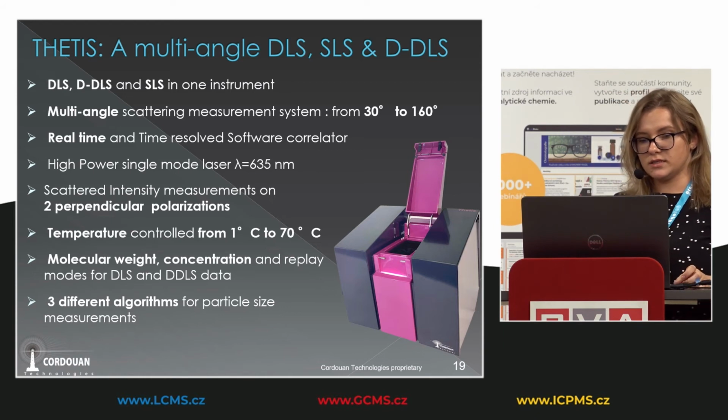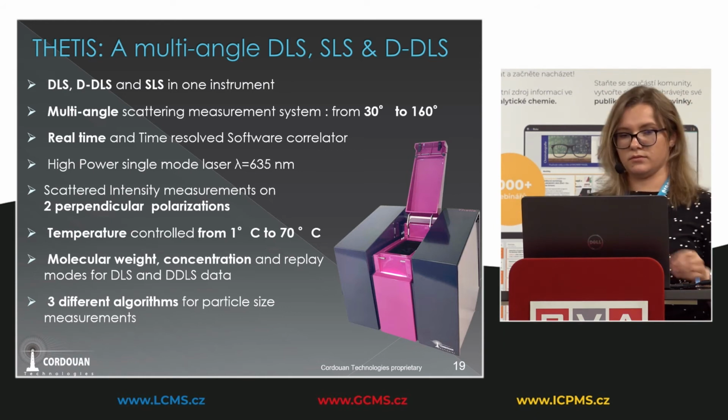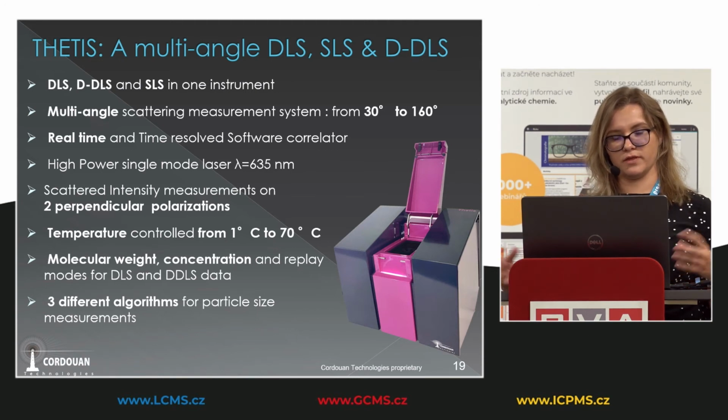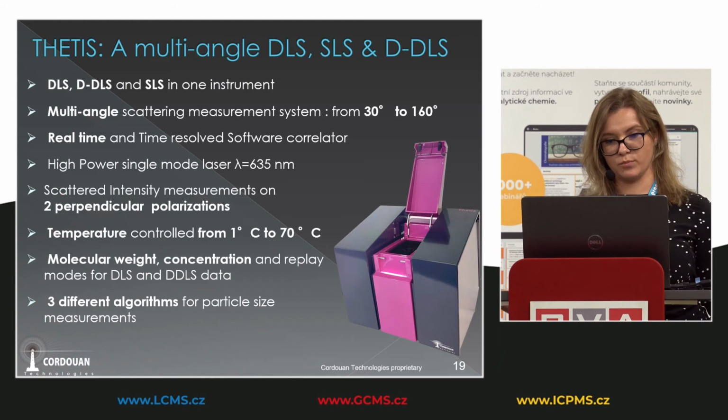Also, in this device, you have real-time, time-resolved dynamic light scattering, so you are able to track the kinetics of your particle growth, for example, the changing of the particle shape with time.